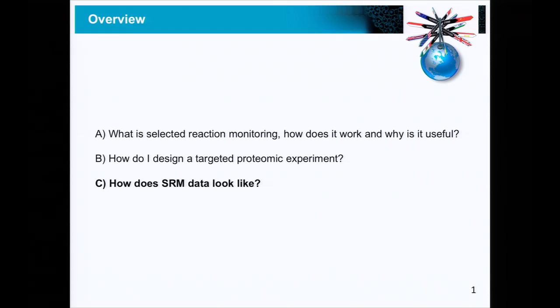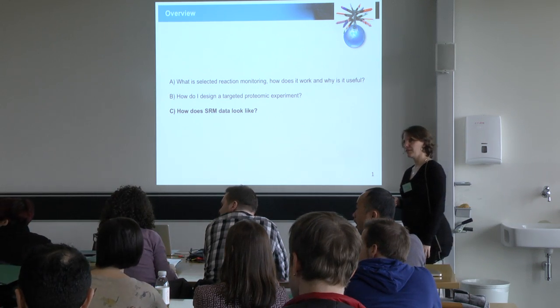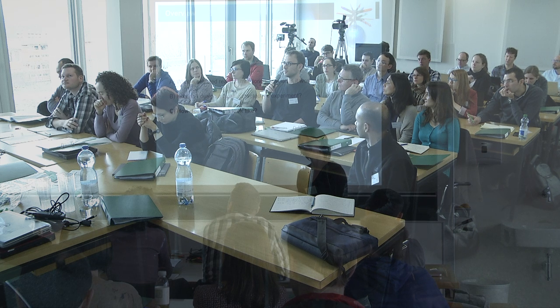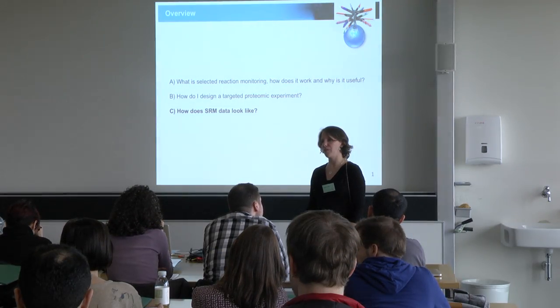Any more questions on how I design a targeted proteomic experiment? Yeah. So in SRM, at no point do you measure the intensity of the precursor itself. It's always the intensity of the... Exactly. In an SRM measurement, you have no MS1 intensity information measured.